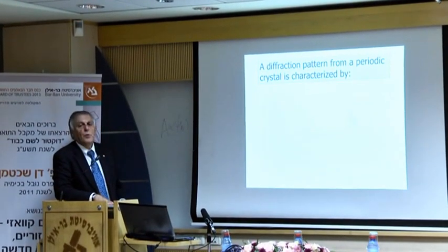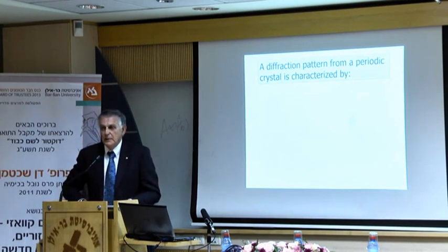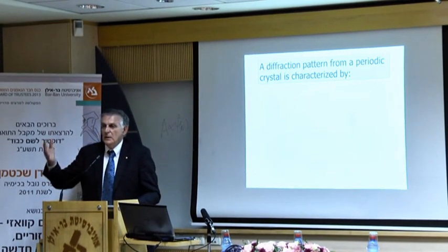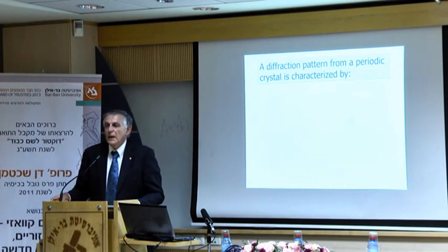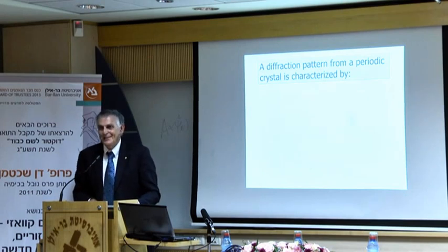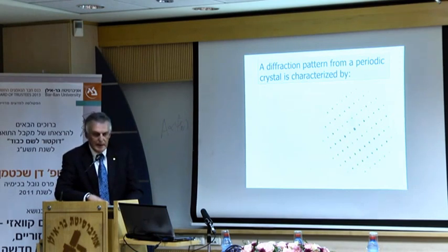Now, when we perform a diffraction experiment, you can perform it with any type of wave: optical diffraction, X-ray diffraction, electron diffraction, neutron diffraction. You can diffract in many ways. I was using electron diffraction. The tool of choice of the International Union of Crystallography was X-ray diffraction. And this made a difference. Here is a diffraction pattern taken in an electron microscope.